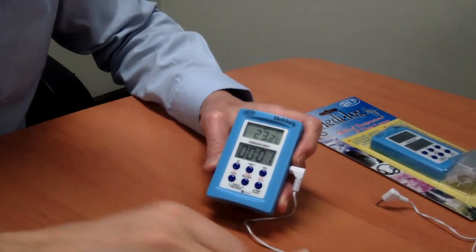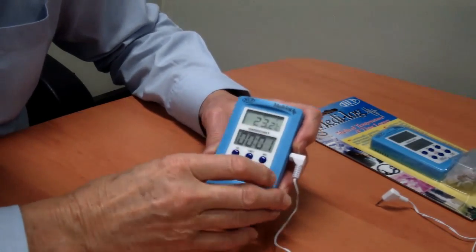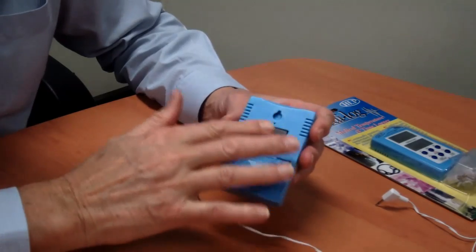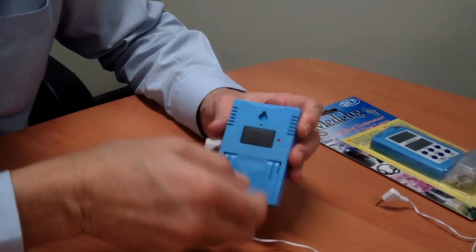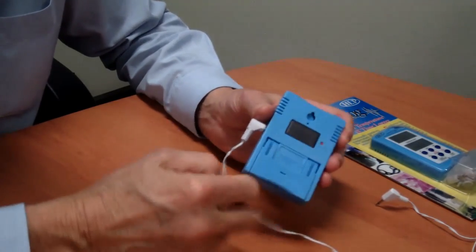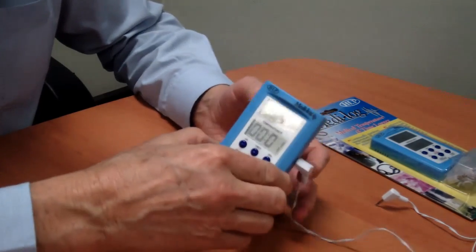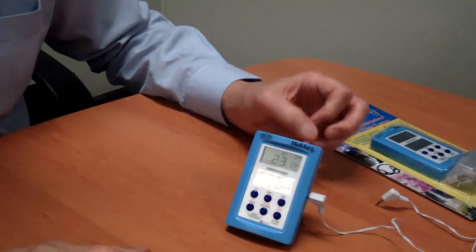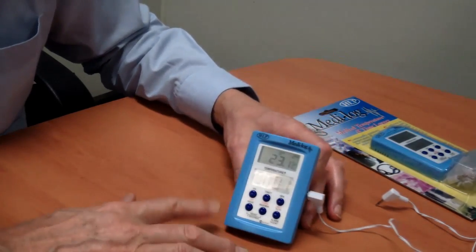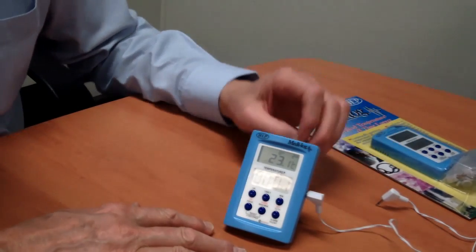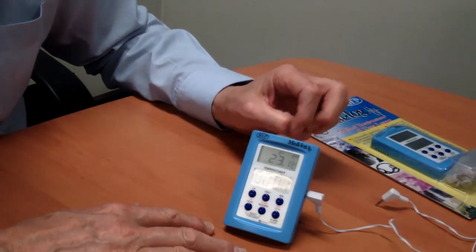It's got a magnetic and a screw hanger as well as a little stand, so it can be magnetically stuck on the fridge, it can be hung on a screw, or it's got a little stand. It also has a double-sided velcro pack that comes with it for mounting.